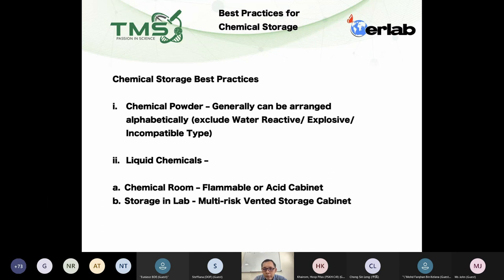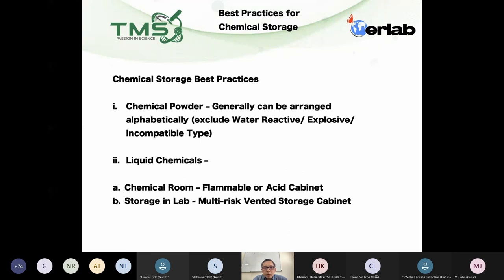There is more than one method of chemical segregation. To be frank, in Malaysia we do not have a guideline for laboratory chemical segregation — we have it for industry and waste storage. Most labs follow either the Stanford method or their own method. What I'm presenting now is the Stanford method, which I hope will be beneficial as a reference you can adopt.